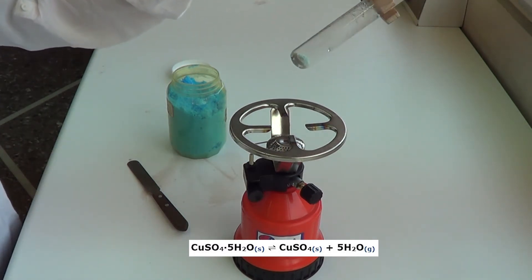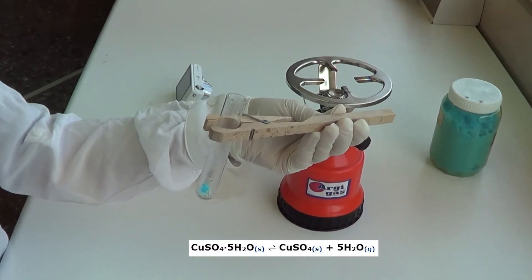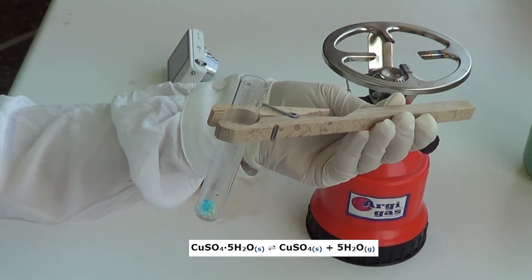Then we remove the test tube from the flame. In a few minutes, we observe the color of the copper sulfate turn back to blue.